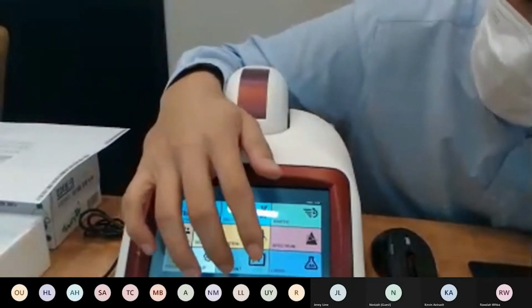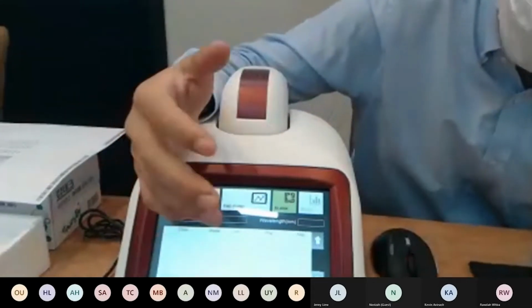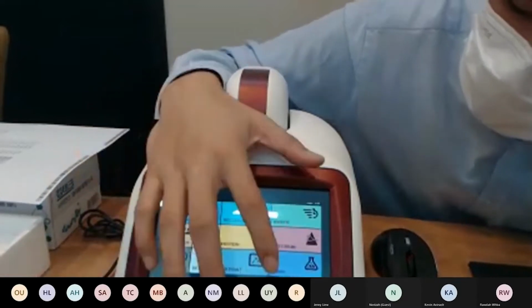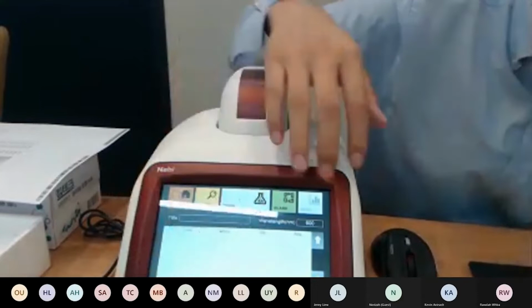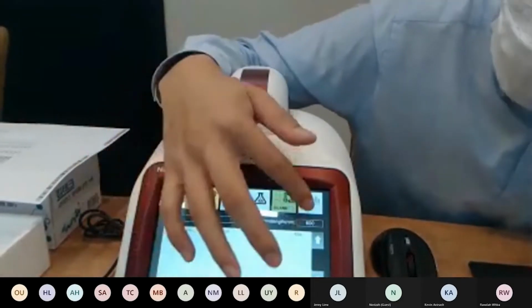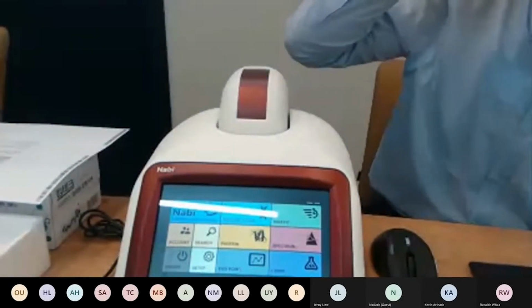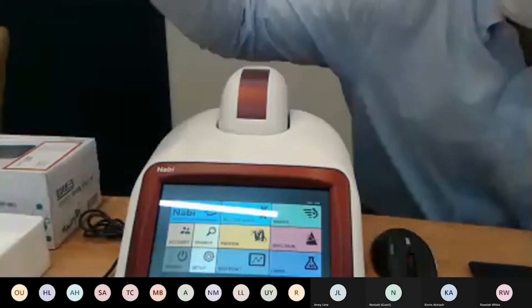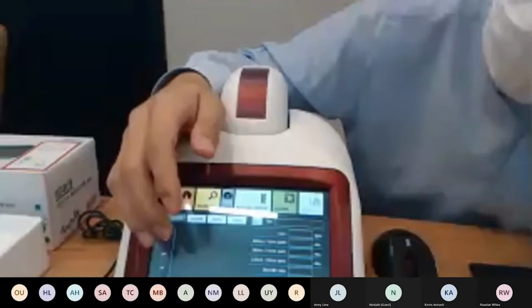Now, we also have the endpoint where you can set up the wavelength and just measure the absorbance continuously. We also have OD600, which is for cell counts. So the wavelength is set at 600, and you can measure them continuously just by setting blank and pressing read. So I'll just show you a couple of demonstrations on how to use the nucleic acid and protein measurements.